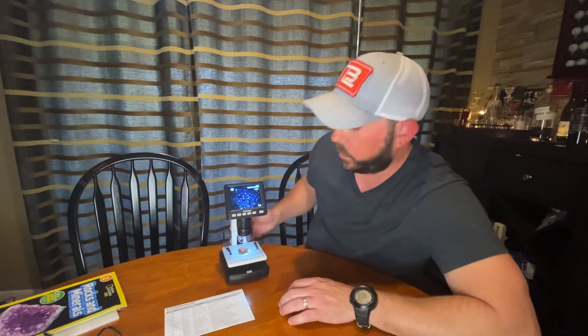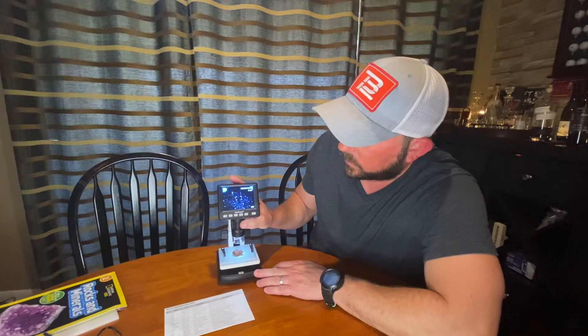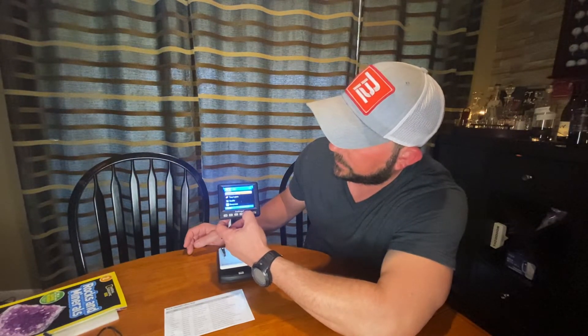So we take this number four rock, which is pumice. You can focus it by going up and down with the microscope, which is really neat. And then if it's not that clear, you can focus it further — that is really, really clear. And then it has a zoom on the side to get even closer. If you want even more perfection, you go to the menu — you can do resolution, or go in and do the quality and sharpness: hard, normal, or soft. So depending on if it's a bug or a rock, you really can get close and see a lot of neat things.